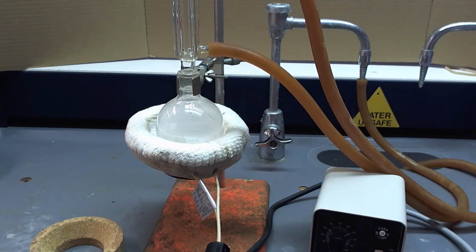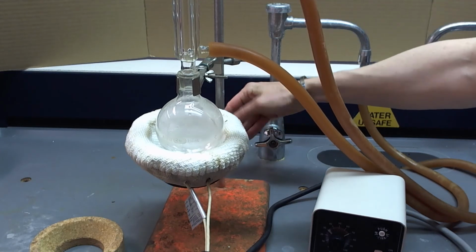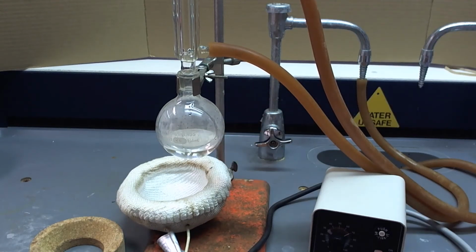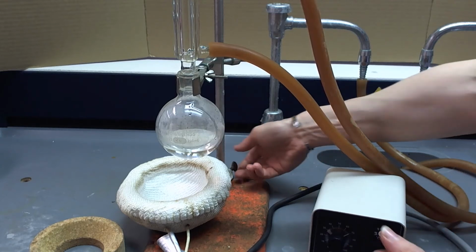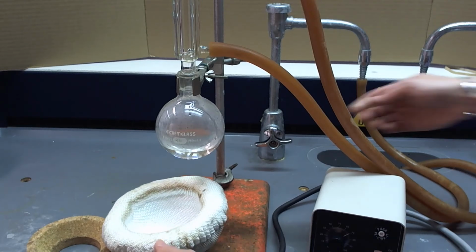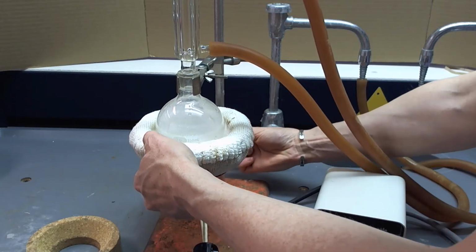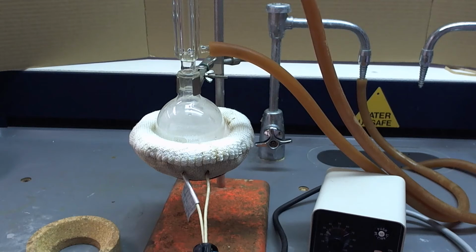Okay. Now, the reason that we elevate our apparatus is that if the heating were to be getting out of control, I can simply reach behind the apparatus, unscrew that ring clamp, and remove the heating mantle without even touching it. That's the fastest way to cool it in case of disaster. You can always use the cord to gently pull it away too, if things were out of control. So that is why we elevate it. It doesn't have to be very far off the floor of the hood, but a little bit up so that we can lower the heat quickly to calm down any runaway reaction.